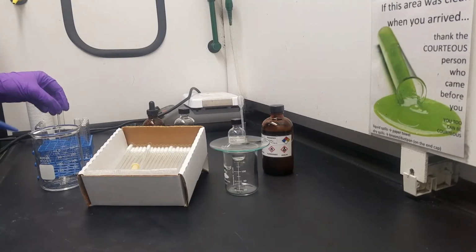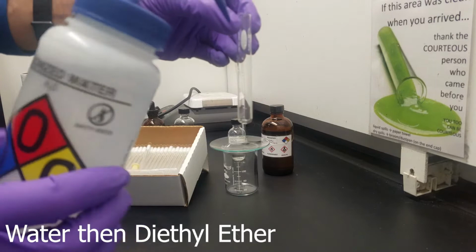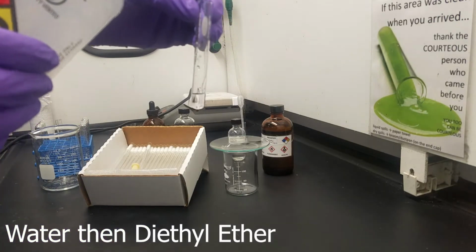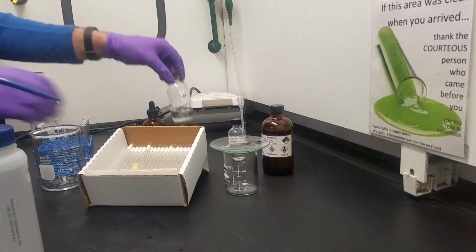More things to observe as you're going through and doing this is notice what's happening with the reagent bottles as well, because I am changing the technique with how I'm using them. Consider those different techniques and ask yourself which one might be better or worse than others.